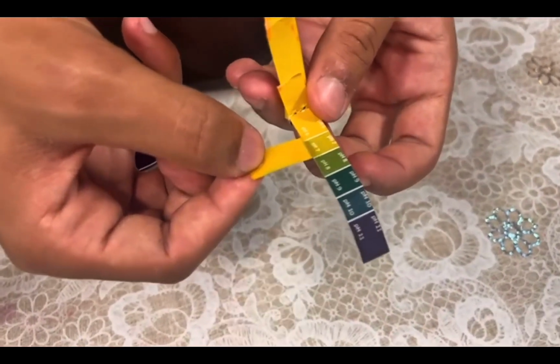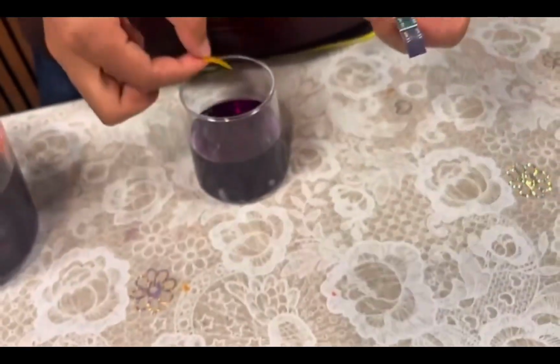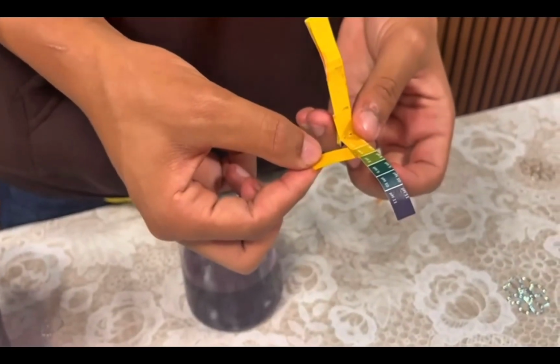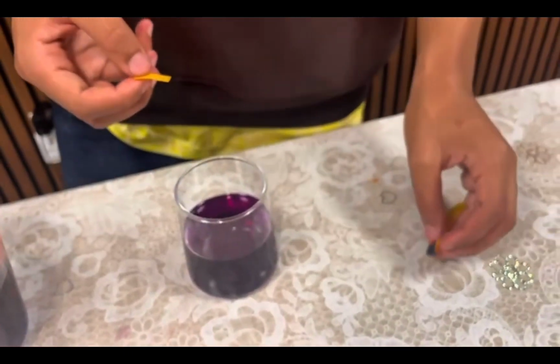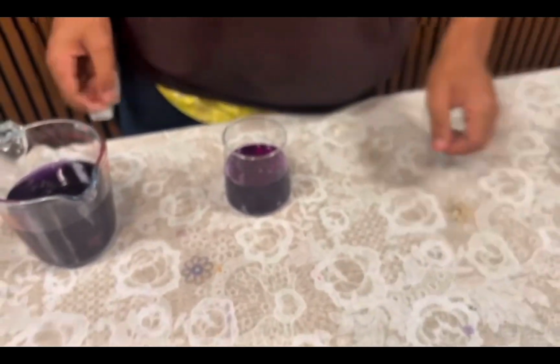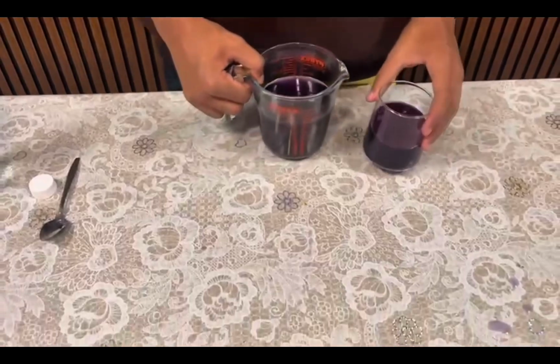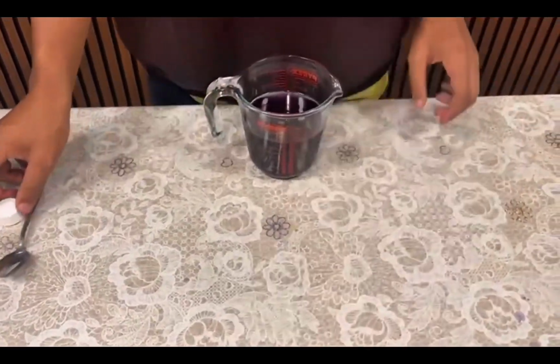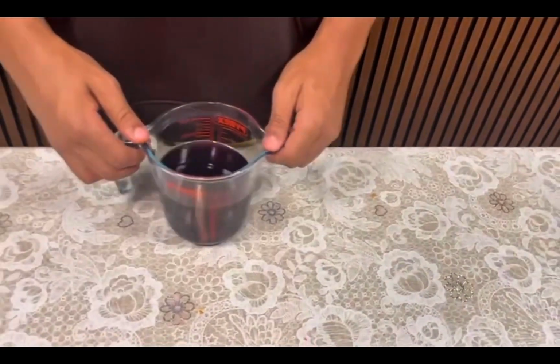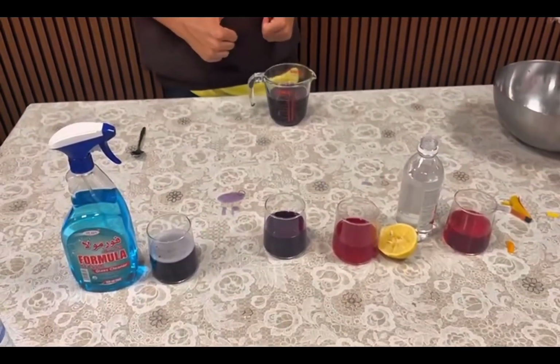Yep, right there, 6 and closer a bit to 7. So there's no color change. If your tap water turns red or green at home, yeah, you've got a problem, bro. Make sure there's nothing in that water. Okay, done with the main experiments. Let's move those to the side and we'll be back with our final and last experiment. That's everything.